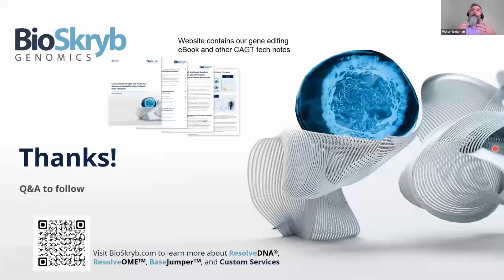And if you saw, especially for the copy number plot specifically, the number of copy changes was super small. It was maybe 10 super tiny ones. Whereas if you looked at that cell line in the bulk sequencing, you're going to see gains and losses across the entire genome. So we feel like we did a really robust job of pulling out those cell line specific changes. Very good. Thank you.